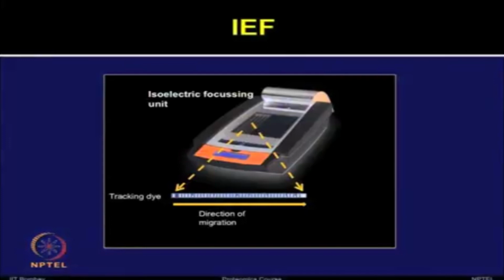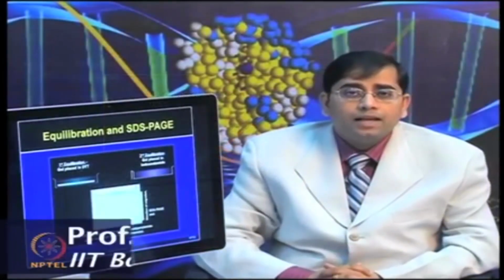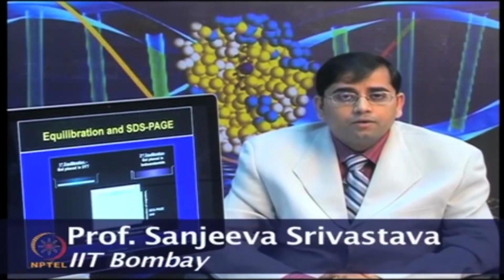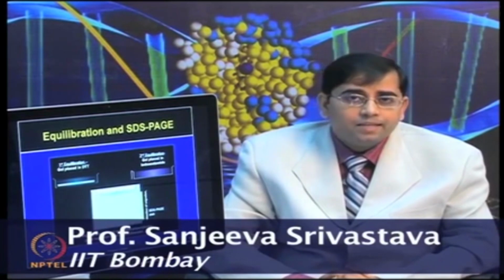It is a good idea to avoid any light exposure during the rehydration, dye reconstitution process as well as while the isoelectric focusing run is in progress. Once IEF is done, again you have to do the equilibration, first equilibration and second equilibration, followed by SDS-PAGE.